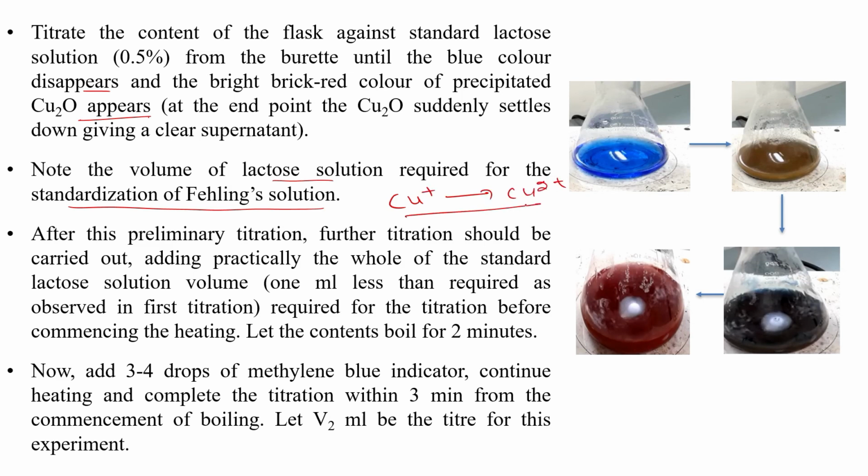And also that there may occur decomposition of the reducing sugar, and methylene blue may get immaturely colorless. So because of these reasons, to save the time in boiling, we will be able to know how much ml of lactose standard is initially required. Say 15 ml is required.